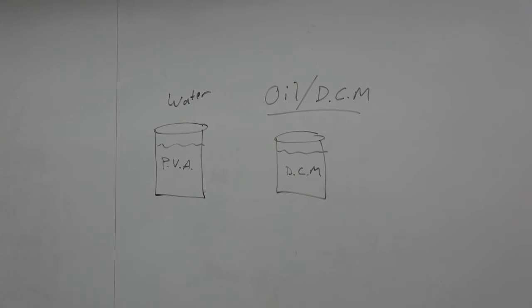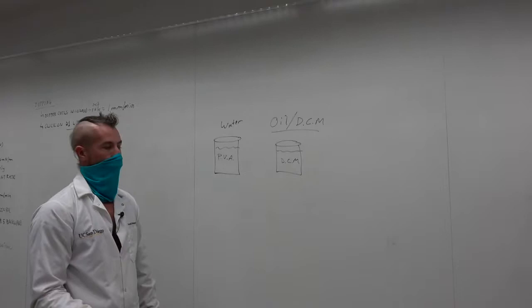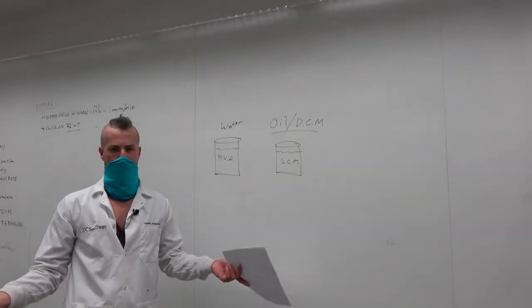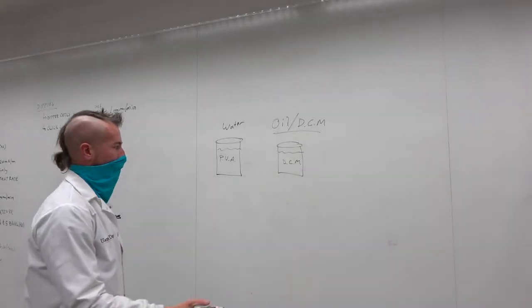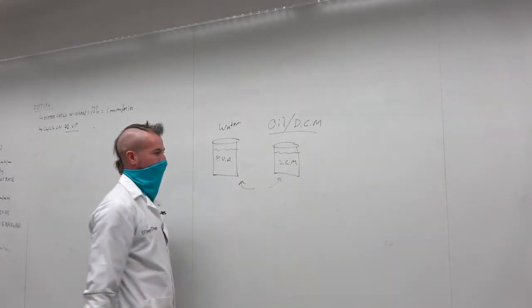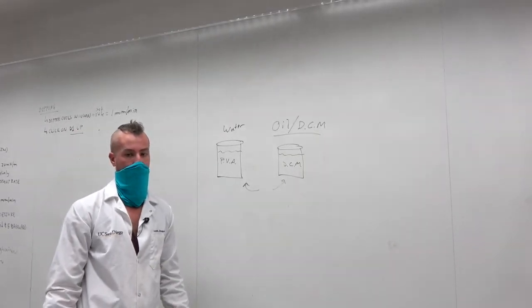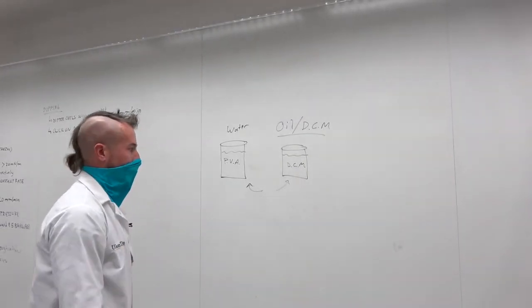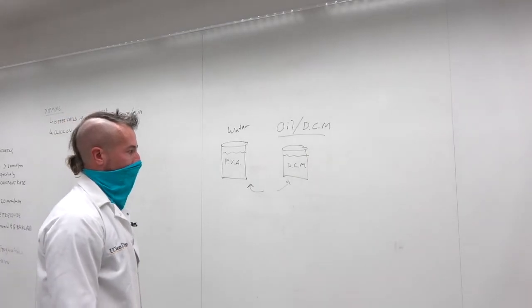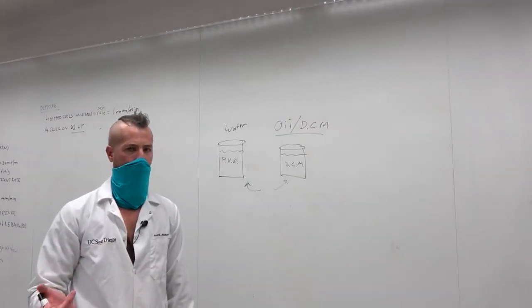Now, this is kind of an important consideration: where does your drug go, right? Does your drug go here, or does your drug go here? Well, it's kind of a function of your solubility, right? So I've definitely made these before with very, very hydrophobic materials.